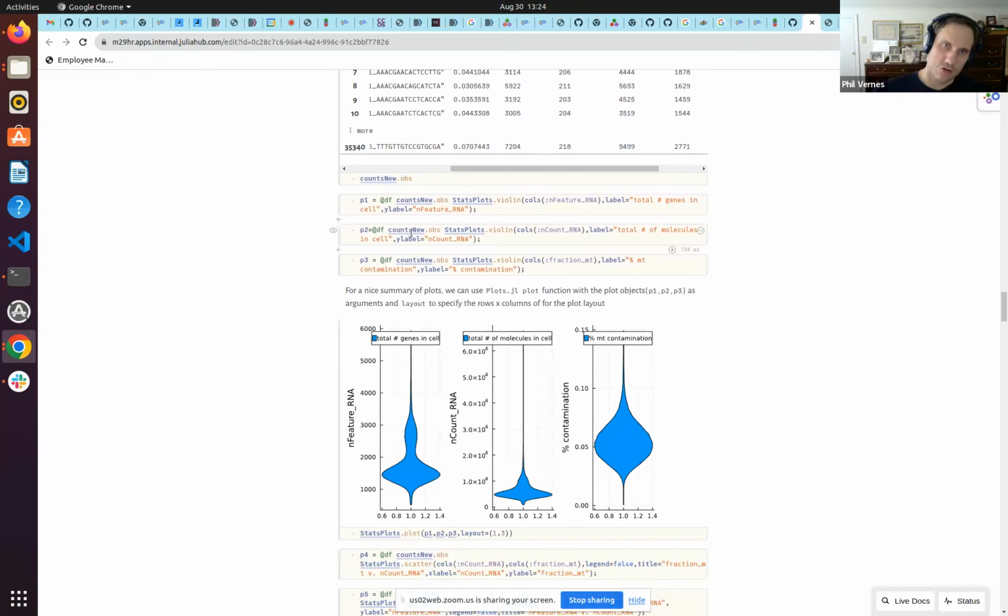To do this in Julia, I'm going to use not the usual Plots.jl library though. I'm going to use something called StatsPlots, and StatsPlots.jl gives me this method. It gives me this thing called a macro, this little @df. What that literally means is that I can directly reference the field name in this expression without having to put the data frame itself in there, right?